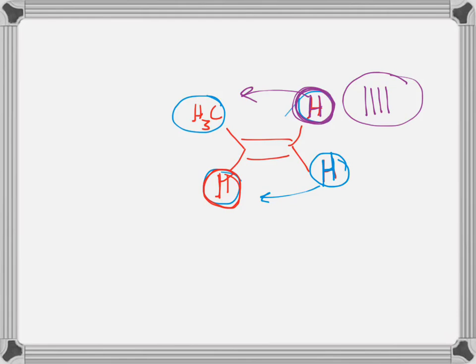No, it won't see the CH3. Why will it not see the CH3? If we count out our bonds, and this is actually a good example for the next thing, there's 1, 2, 3. I'm ending at the carbon. Remember we said it's not the 3 bond rule, it's the less than or equal to 3 bond rule that works 99% of the time.